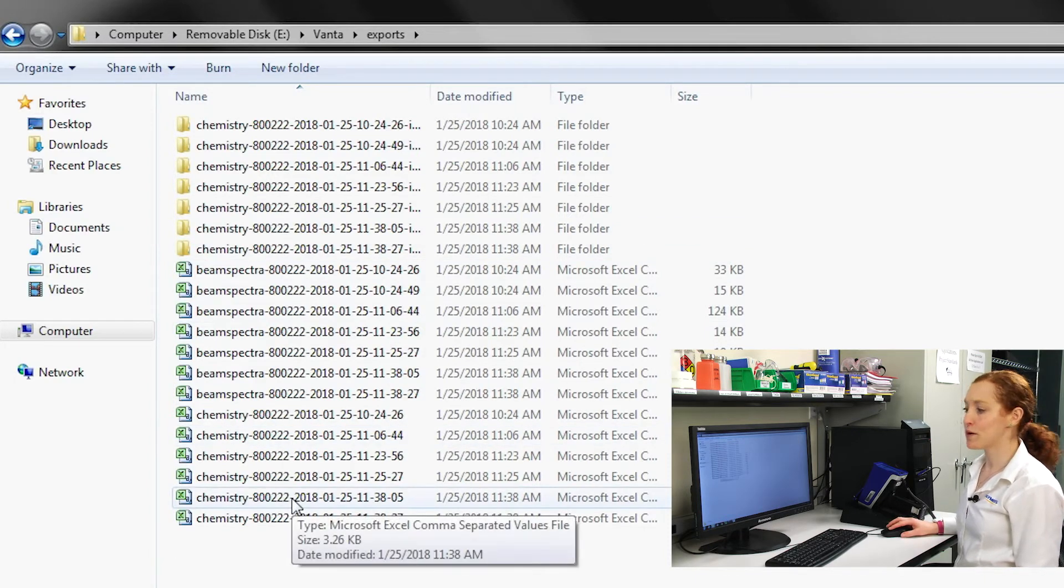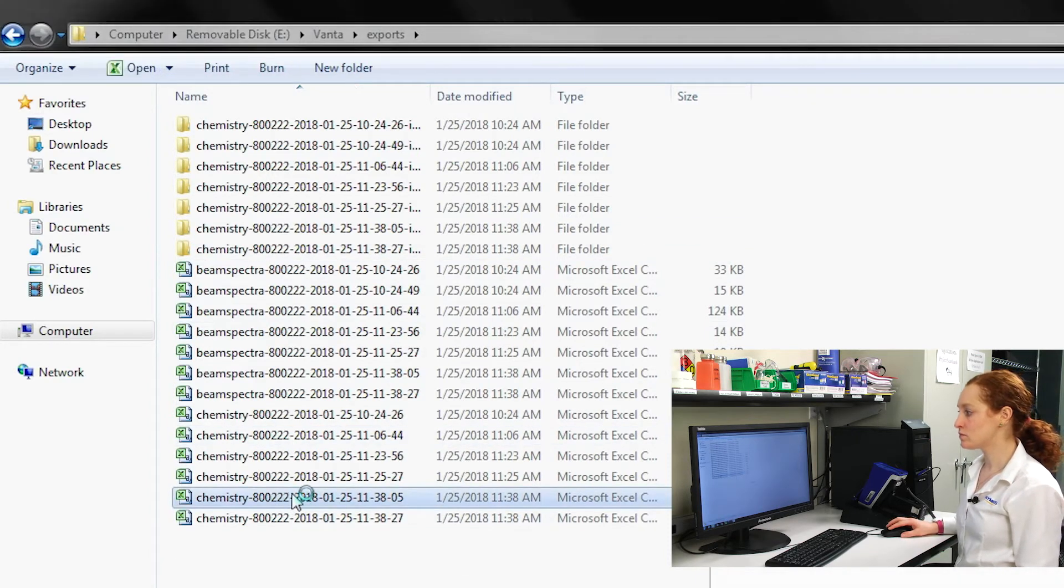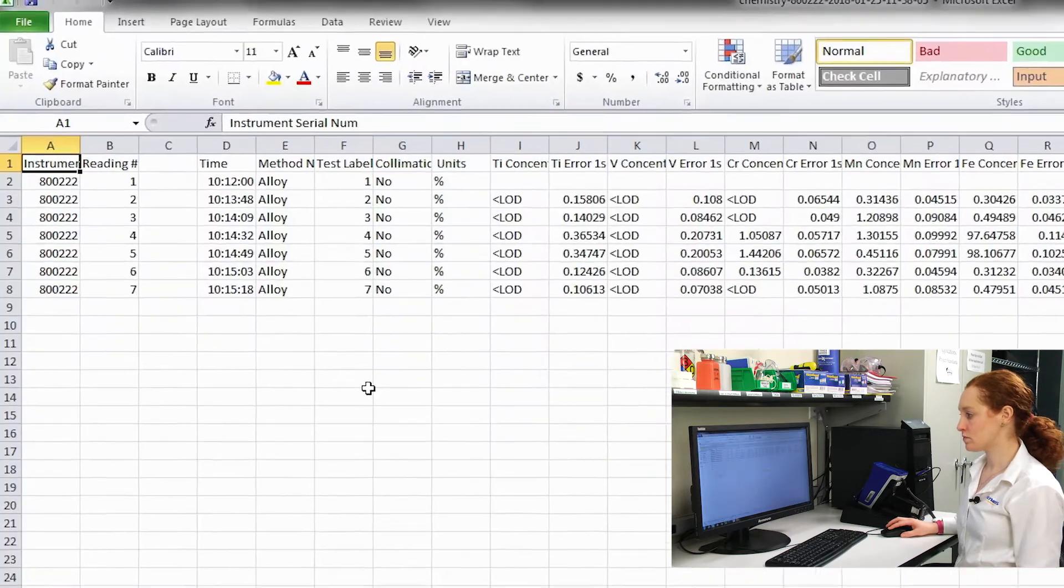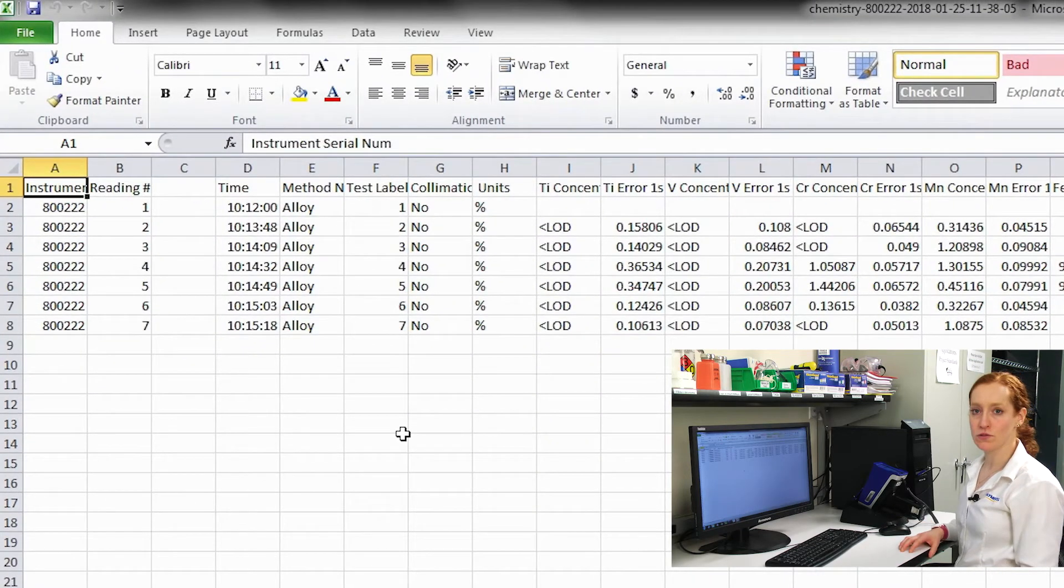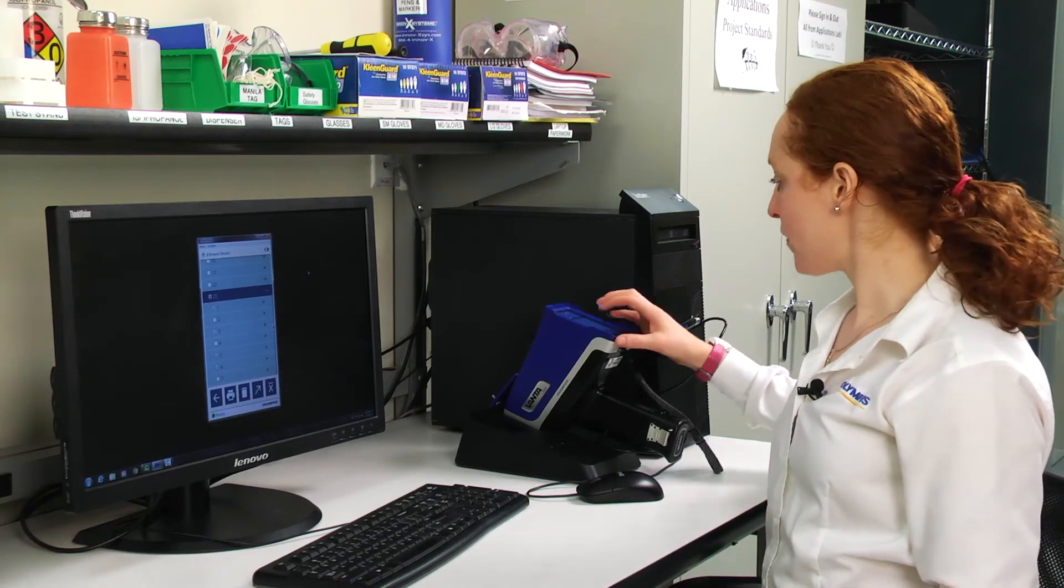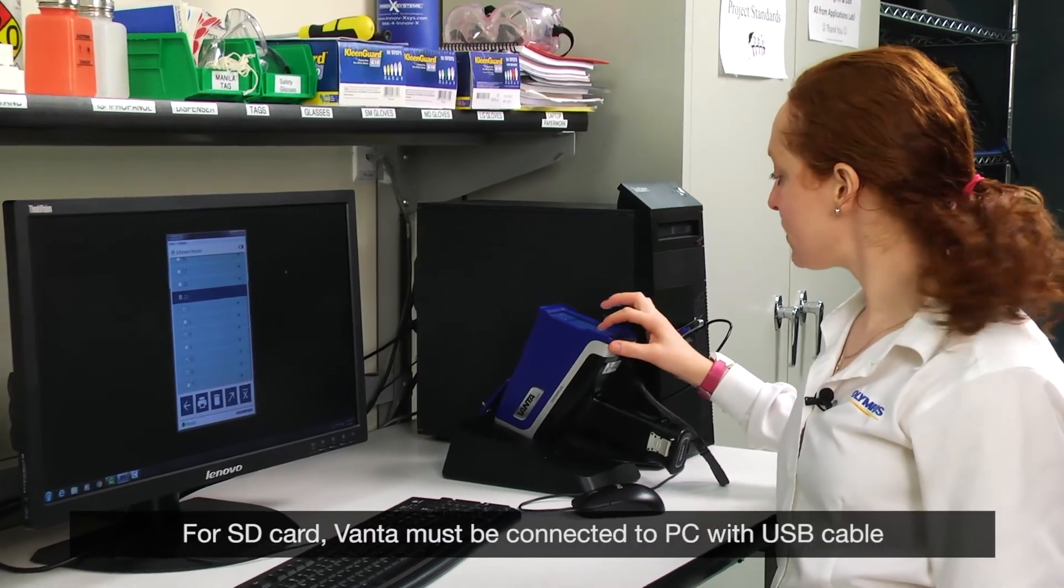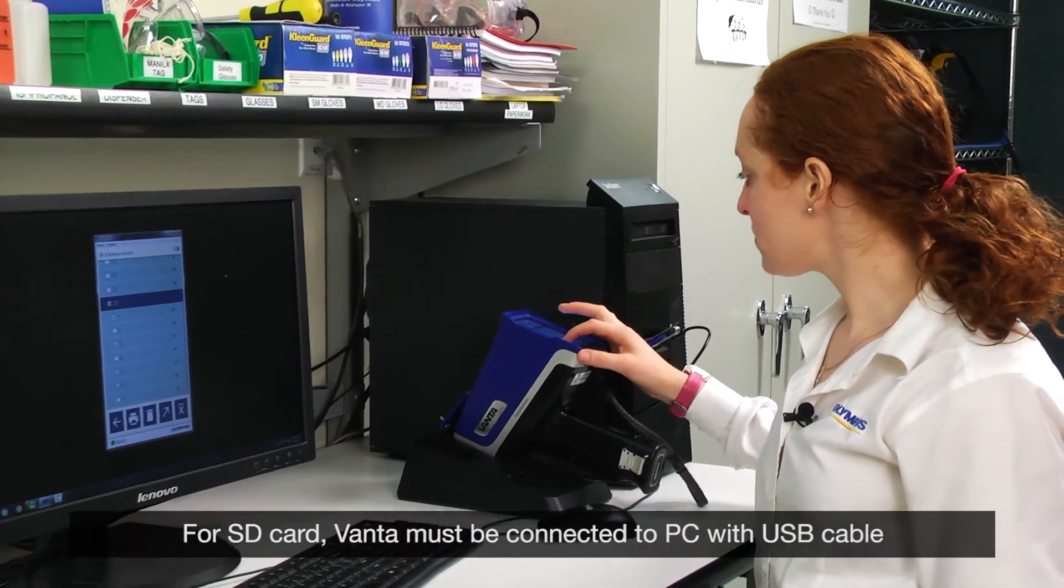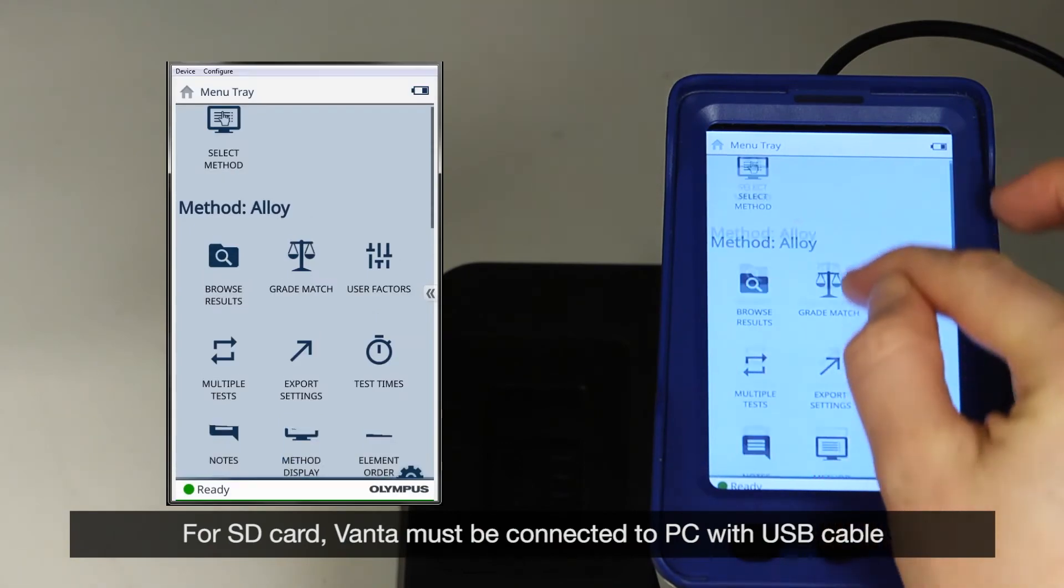If I open up a chemistry file, I'll see all of my results in CSV format. To export to the SD card, I need to go back to the Vanta and change my export settings.